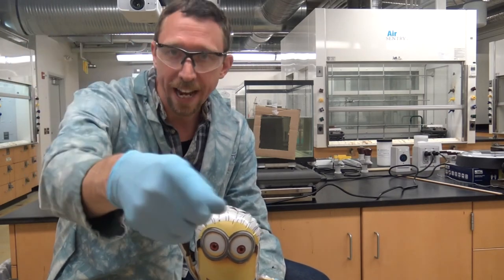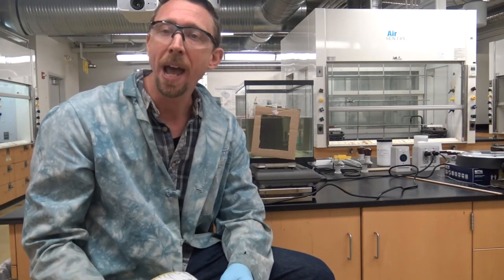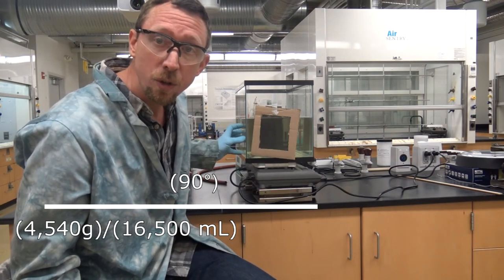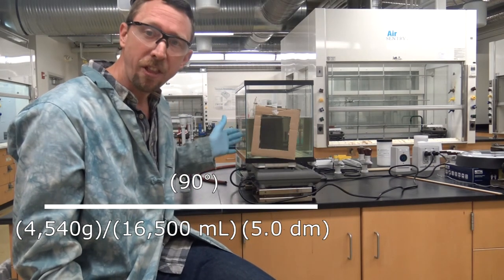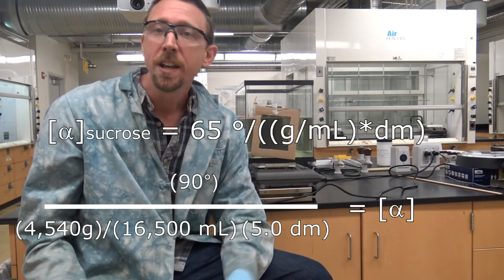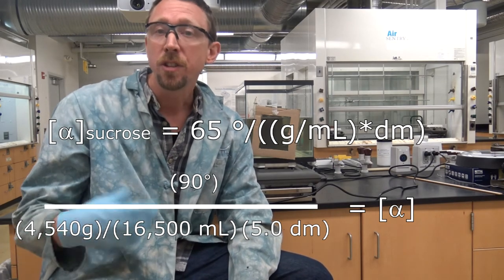But when we placed a chiral solution in here by adding sucrose to the mixture we discovered that that plane of polarization actually changes as the light traverses the tank and therefore we had to rotate our second polarizer by a certain amount in order to see our image, see the light that was originating from our source. Now using that angle of rotation, the concentration of the sucrose in the solution here and the path length of the tank that it had to traverse, we can calculate something called the specific rotation of sucrose.